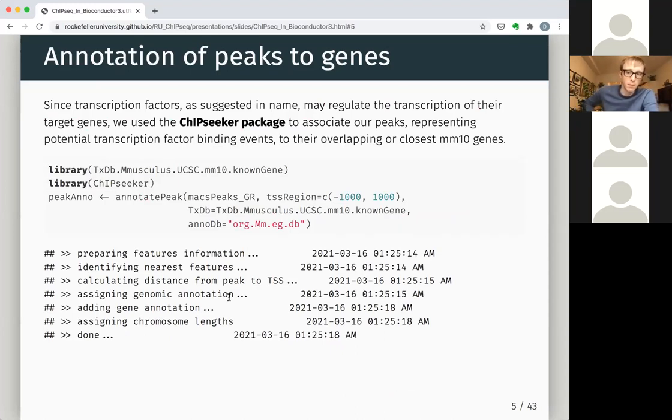And again, it's a good question earlier, how confident are we in these annotations? It depends. We're going to use promoter-based annotations, and those you're usually a little more sure of, but as with anything in science, this is a hypothesis and it obviously has to be tested. Annotations can be good and some can not be so good. So it's really just a place to try and explore your data and see if you can think of some interesting questions to move forward with.